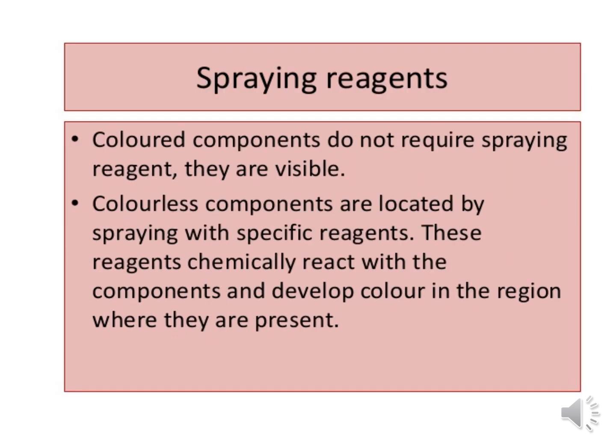And third one is spraying reagents. Colored compounds do not require spraying reagent. They are visible. Colorless compounds are located by spraying with specific reagents. These reagents chemically react with the components and develop color in the region where they are present.